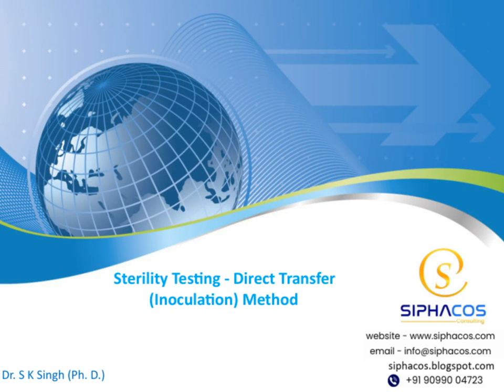I'm Dr. S.K. Singh, and I'm pleased to have the opportunity to discuss an important aspect of sterility testing. Today's focus is on the sterility testing direct transfer inoculation method. In this session, we will explore the principles, procedures, and significance of this method in ensuring pharmaceutical safety. I look forward to sharing useful insights with you all.